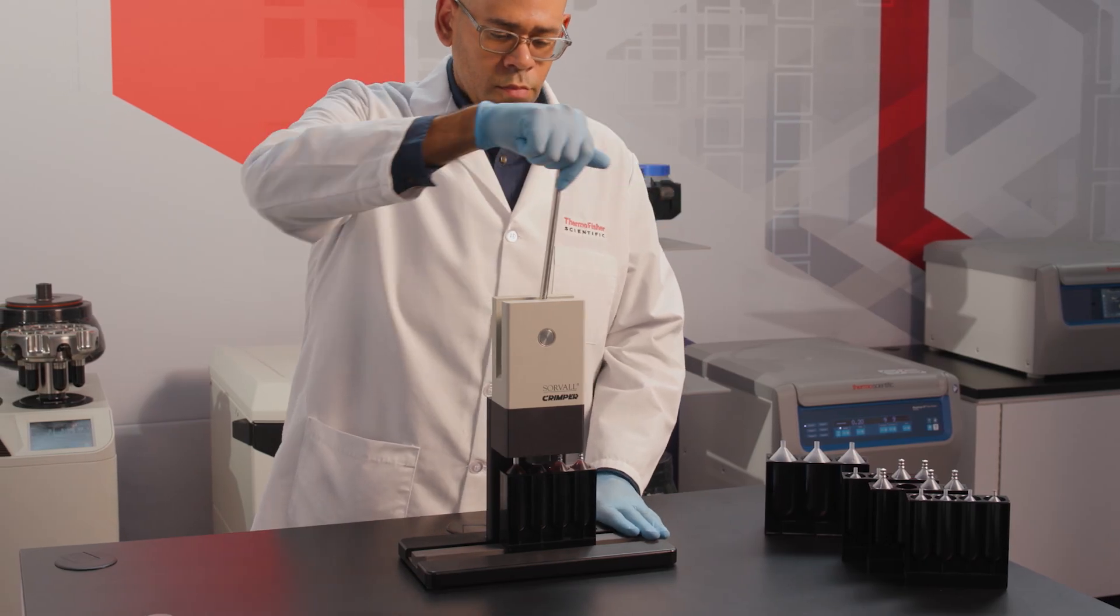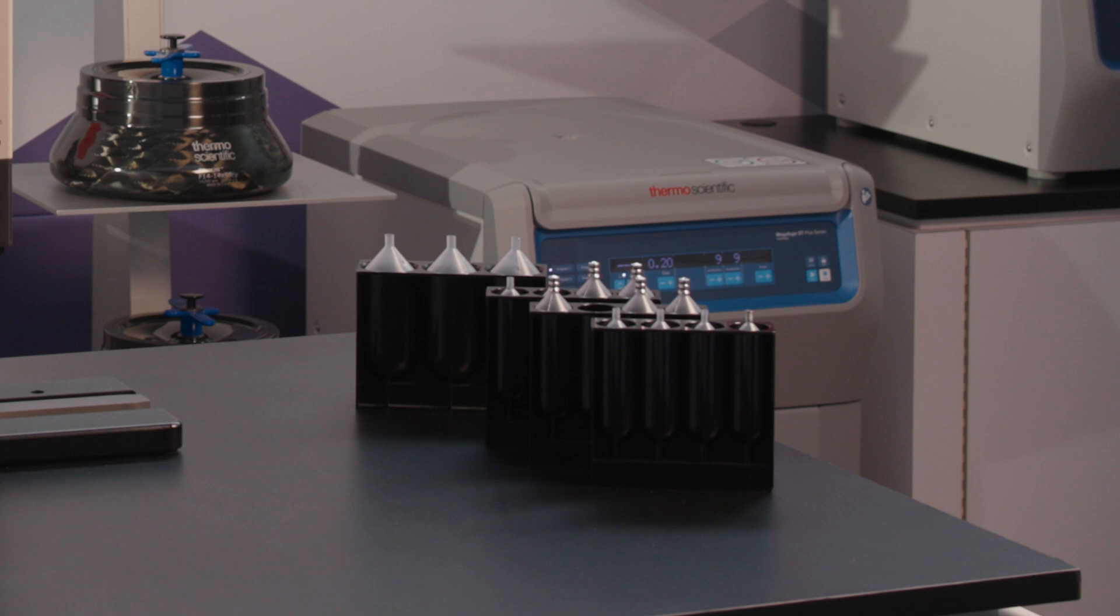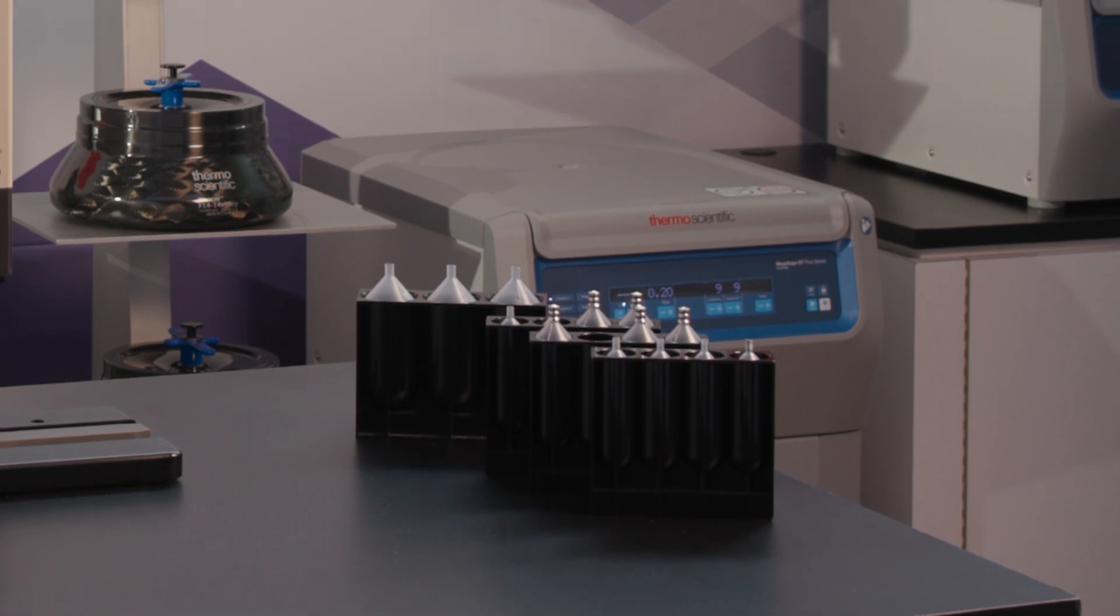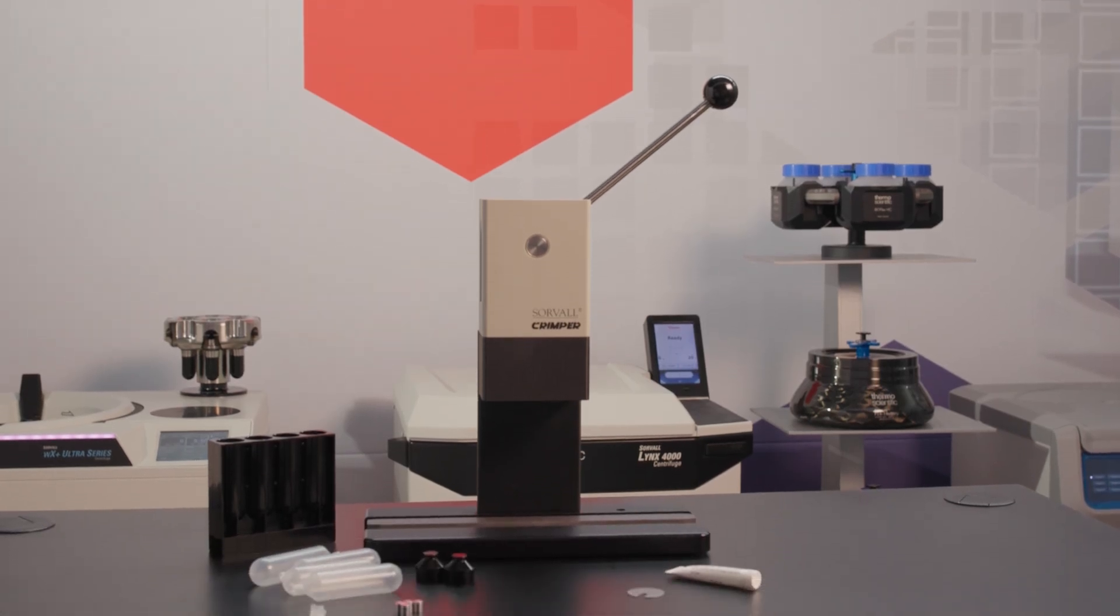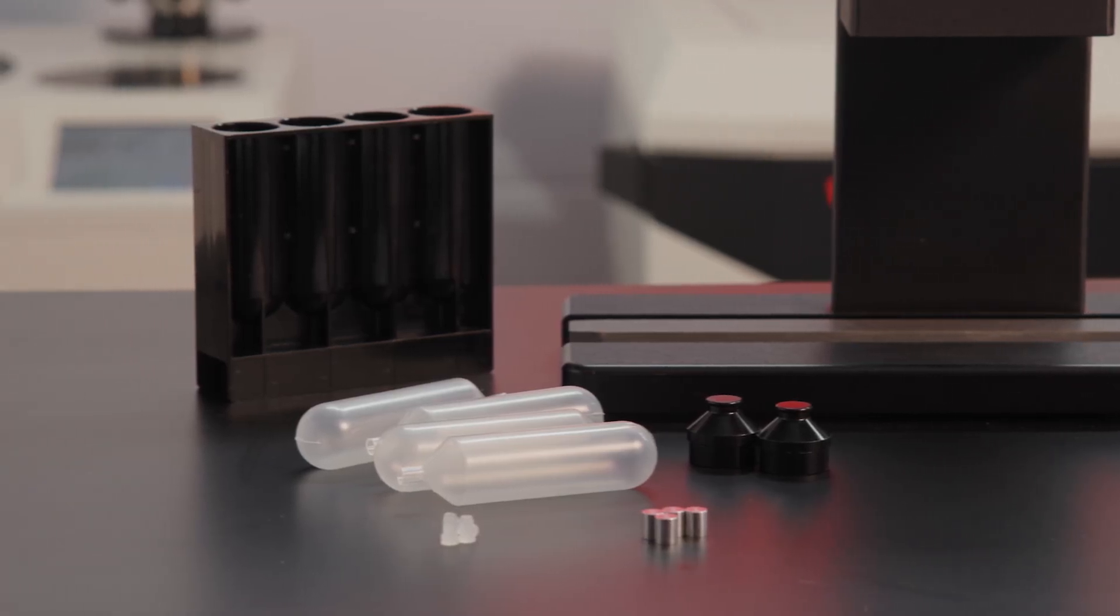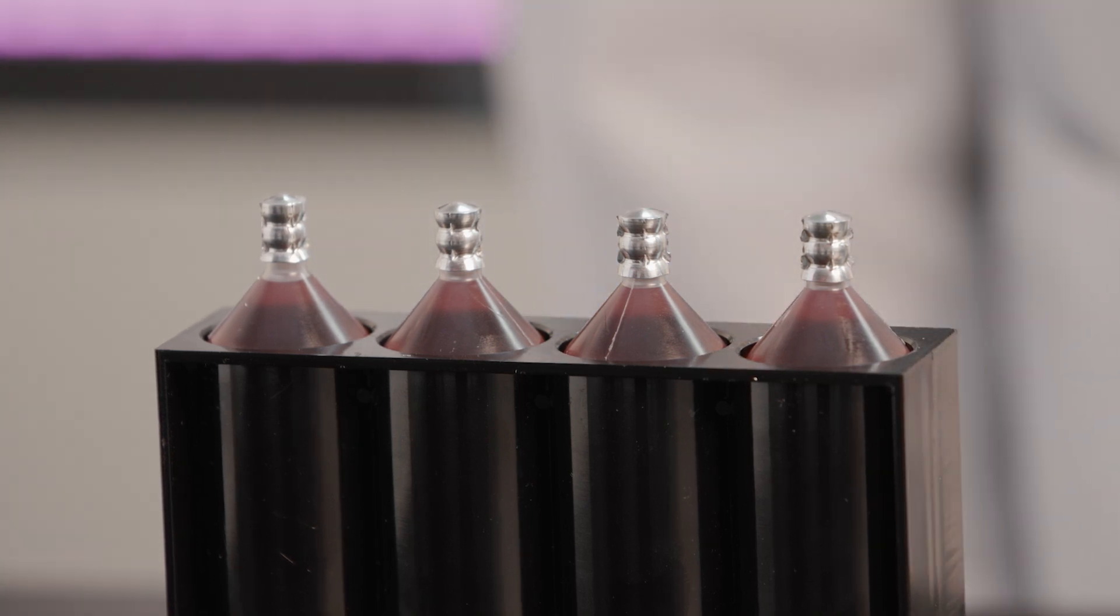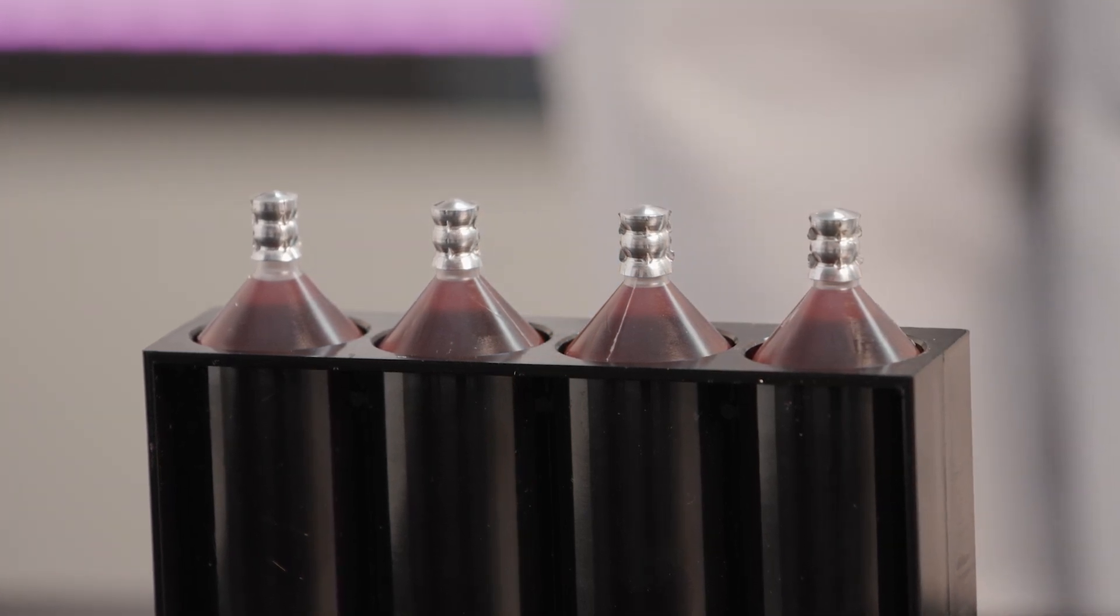Today we're going to talk about how to seal ultracrimp and clear crimp tubes for use in ultraspeed centrifugation. We'll use the thermoscientific crimper tool to seal thin walled ultracrimp polyallomer tubes and clear crimp polyethylene tubes to prepare them for ultracentrifugation.